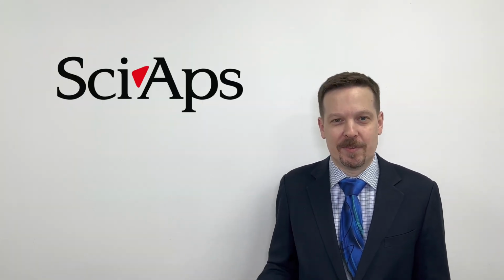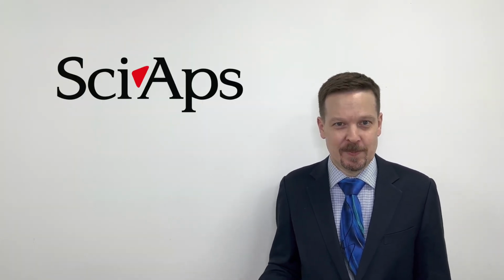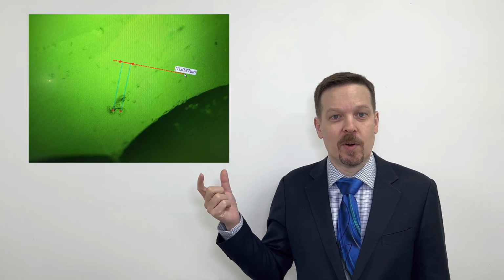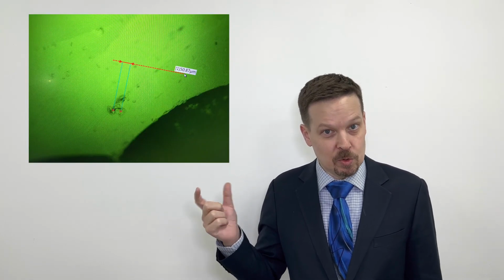A good example of this is in the jewelry industry, where they'll often use beryllium coating to make the stone look more clear and more valuable to a potential buyer. So in order to identify this, you can test the outer reaches of the stone to identify whether or not there's beryllium and it's been treated.